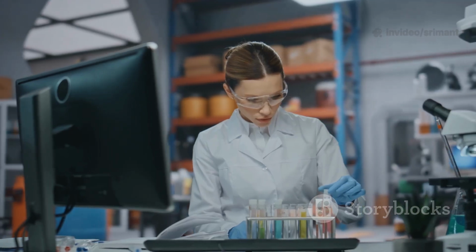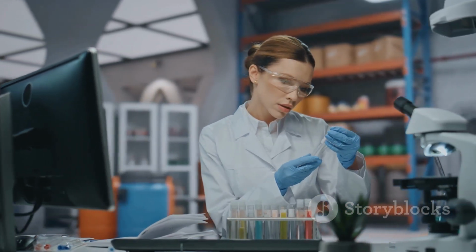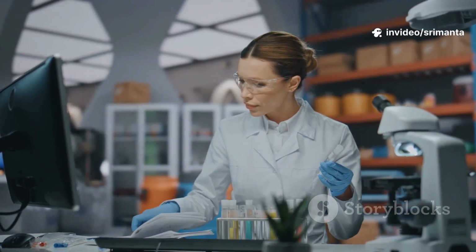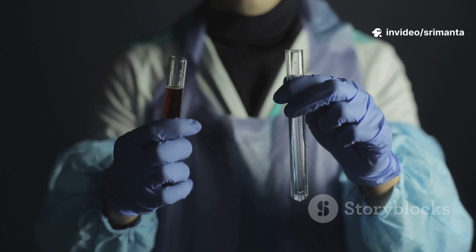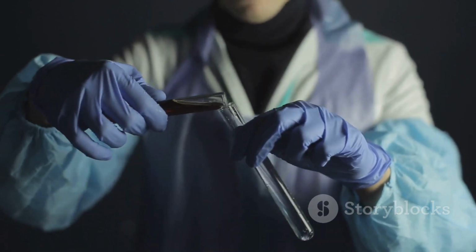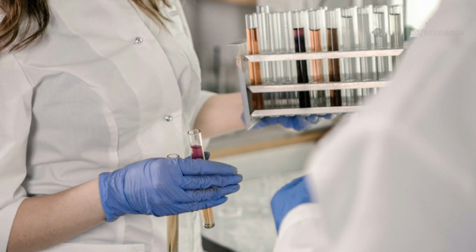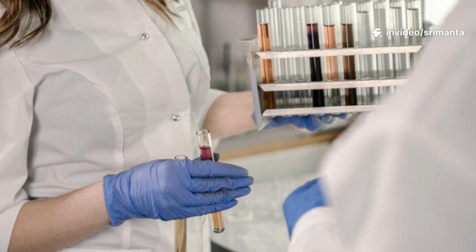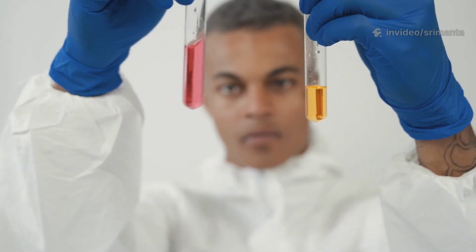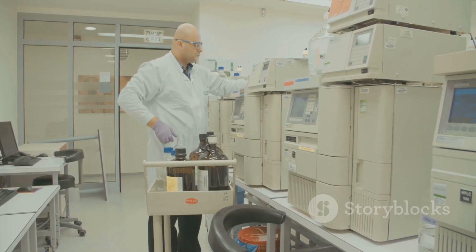This test is what we call a limit test. It is not designed to give us a precise number, like saying there are exactly 0.005 milligrams of arsenic. Instead, it is a comparison test. We prepare two setups at the same time. One uses our test sample, the substance we are checking. The other uses a standard solution, which has a known, very small, and acceptable amount of arsenic. We run the test on both and then compare the results. If the stain from our sample is lighter than the stain from the standard, we know it is within the safe limit. It is a simple, visual way to make a very important decision about safety.